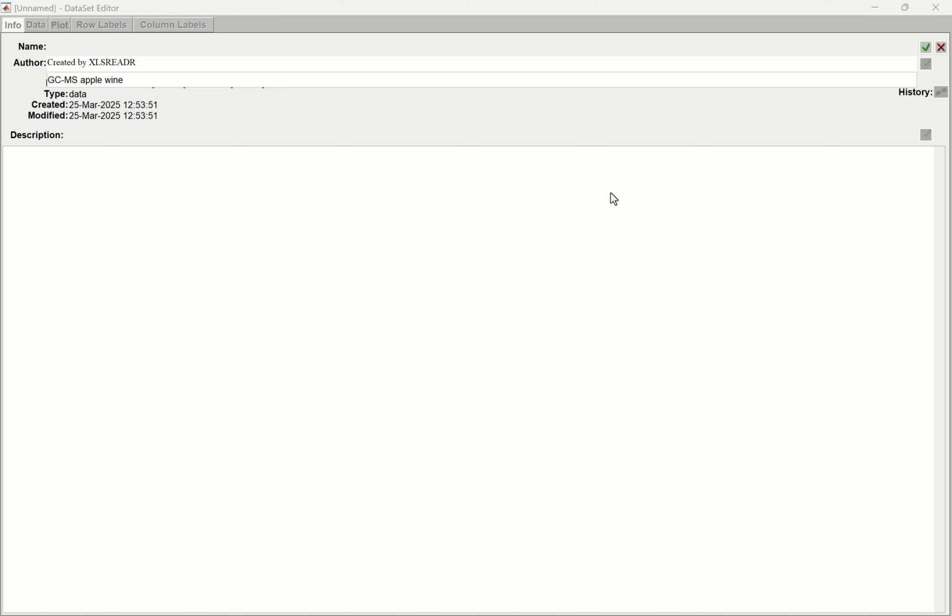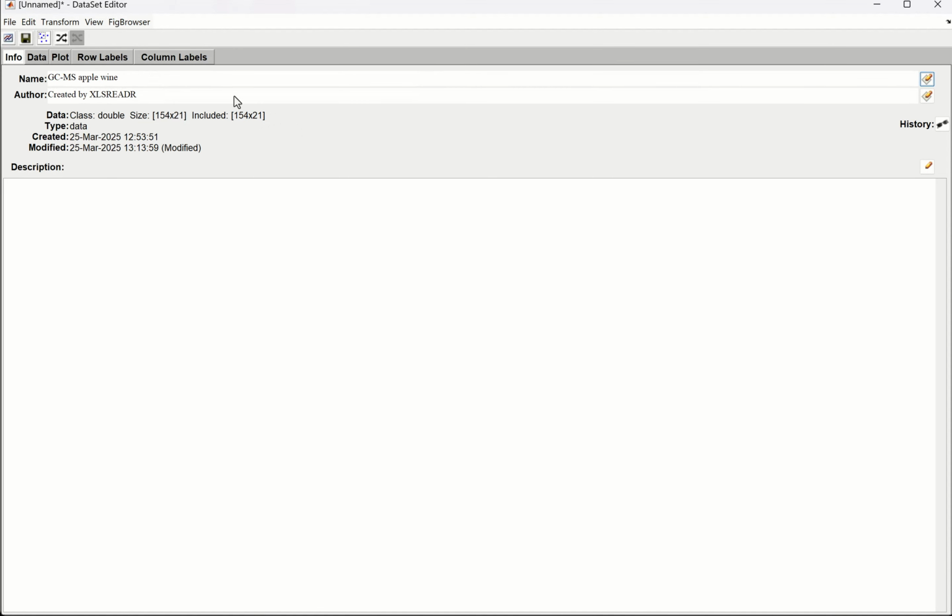I wanted to talk a little bit about limit of detection. I think I have a nice example. We made a data set decades ago, I think. It was apple wine fermentation. At that time, the data were measured by GCMS and analyzed into peak tables using ChemStation. And at that time, we found 21 metabolites, and one of them, actually, let me plot the data, was acetone.